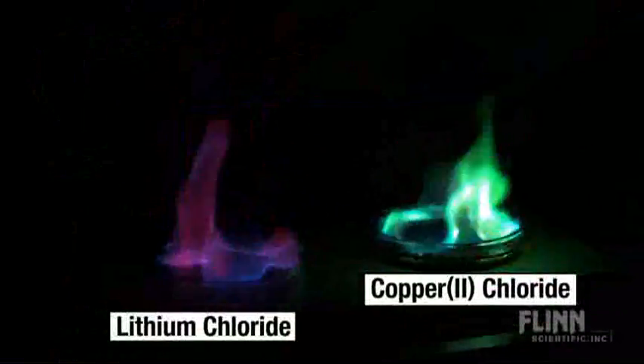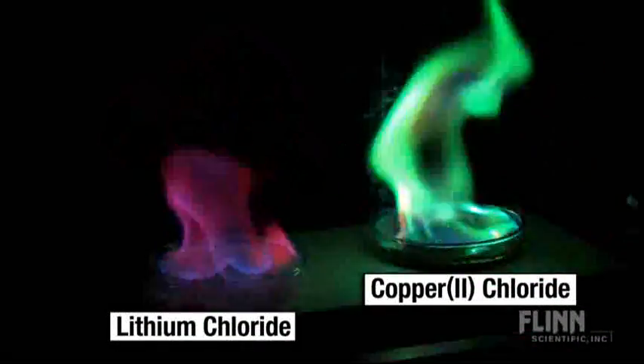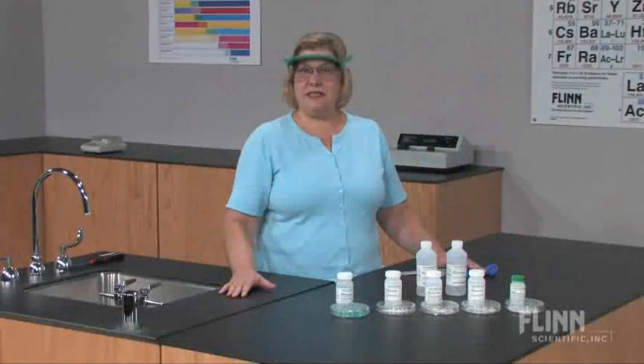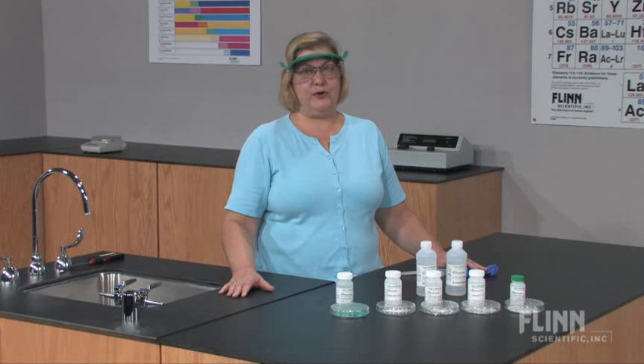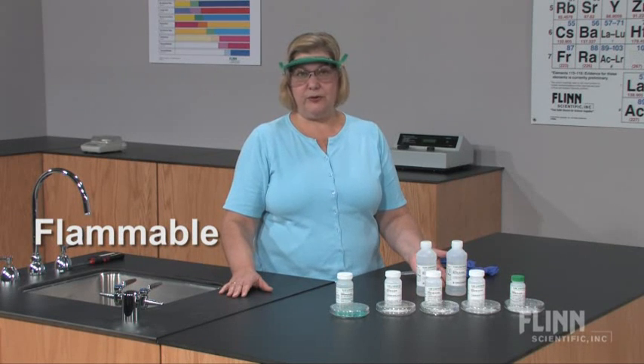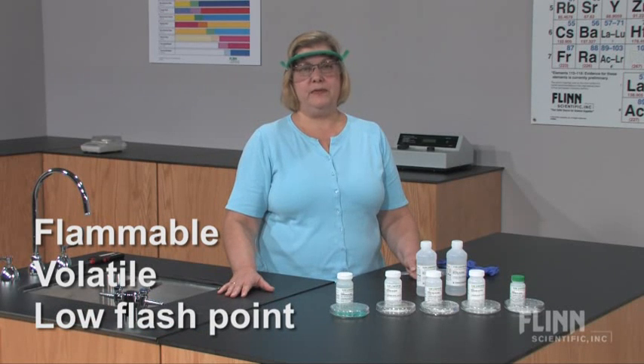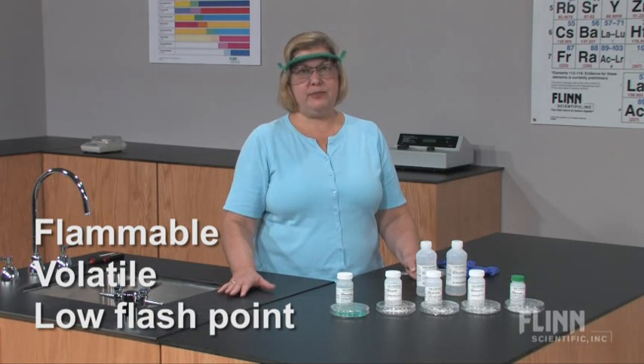This large-scale flame test demonstration kit from Flynn Scientific is one of our most popular products. This demonstration, however, is very dangerous if not performed properly. Methyl alcohol is a flammable liquid — it is volatile and has a very low flash point. The demonstration can be performed safely. Here's how.